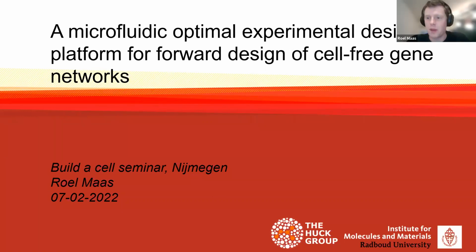So welcome everyone, and I want to thank you already for joining my talk. Like Wilhelm said, I'm Roel, and I'm doing my PhD in the group of Wilhelm Huck. And today I'm going to talk to you about the work I've been involved in the last 4 years, and it's about a microfluidic optimal experimental design platform for the forward design of cell-free gene networks.